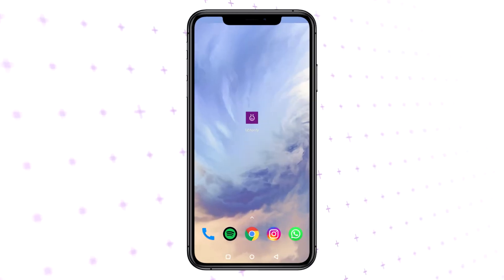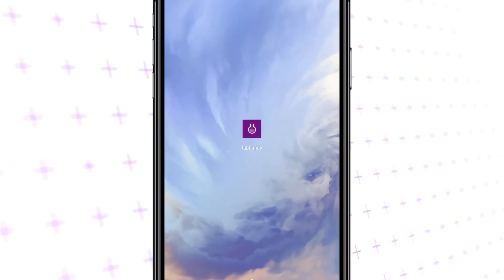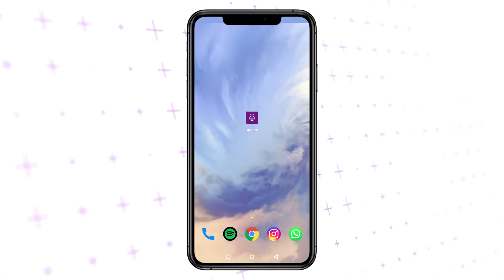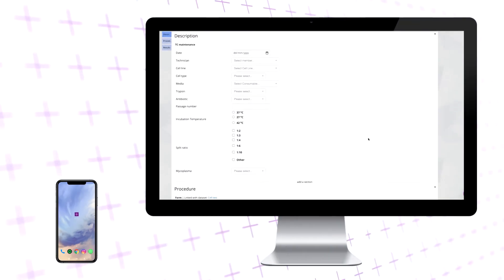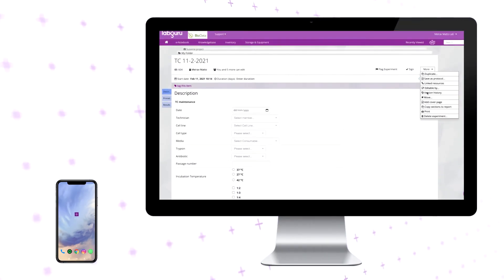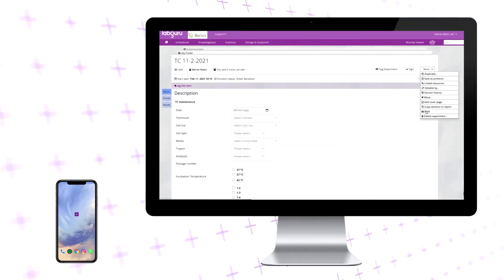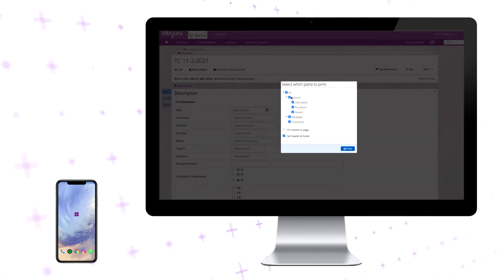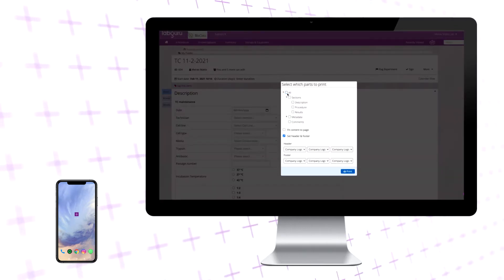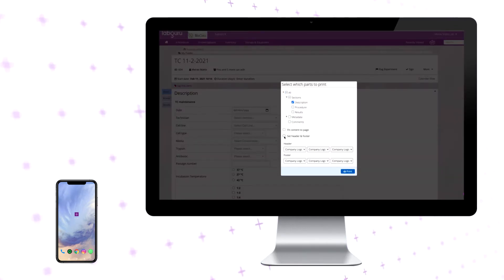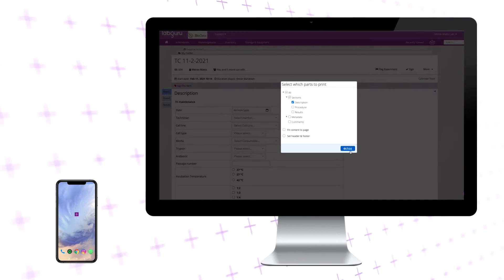Start by downloading LabHandy from the relevant App Store. Prepare the required table using your LabGuru account. The table will contain the experiment ID to be later used when uploading. Print it before starting your bench work.